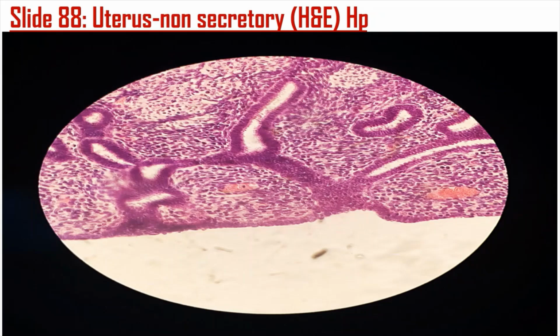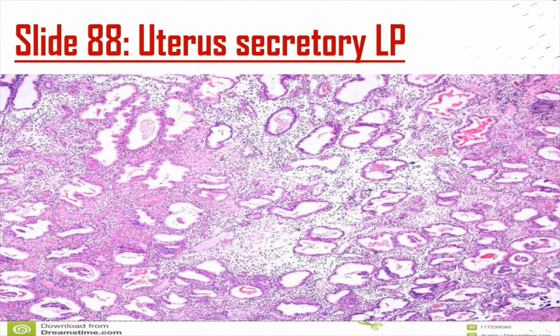This is a gland here. This is a gland. This is the clearer gland. This gland here is lined by simple columnar epithelia. So make sure you indicate that this is simple columnar epithelia that is lining the gland. Draw this gland, show the connective tissue, and draw this gland here. That's all. Now let's go to a lactating or secretory uterus.